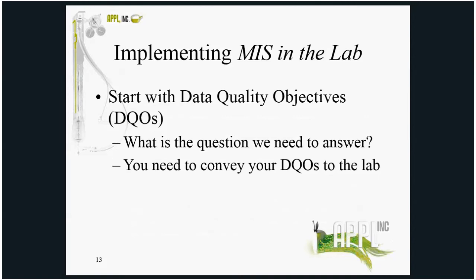MIS investigations result in significantly fewer bulk samples for analysis than discrete sampling methods, and only MIS methods are recommended for site evaluations in Hawaii. MI samples are large in mass, which impacts the laboratory in the handling and the processing time and associated costs.